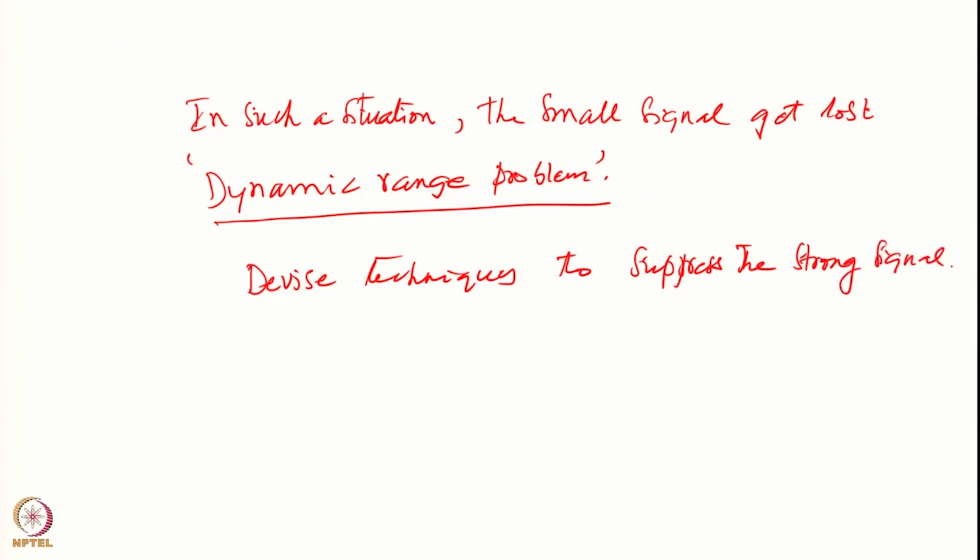Most often the strong signal is from your solvent. Okay. It is not of much use for you to collect water signals, solvent signal. Therefore you can suppress that strong signal, so that you can observe your actual signals. And there are various strategies to do this. So therefore we will come to the next topic, which is called solvent suppression.